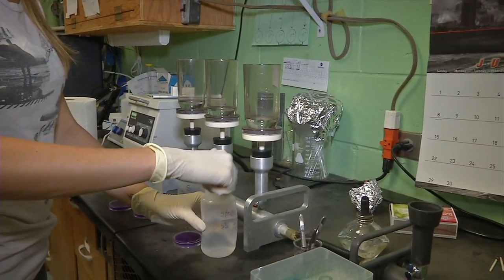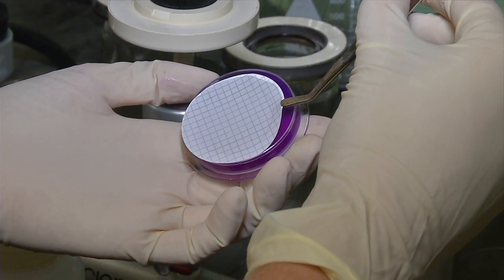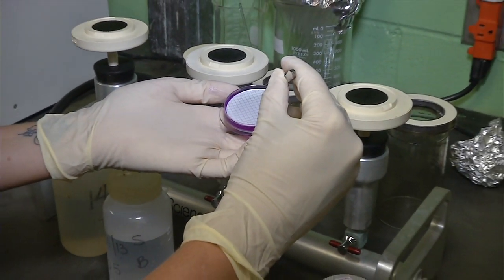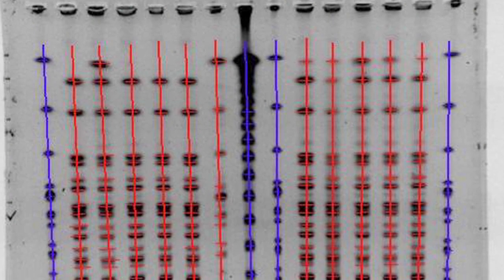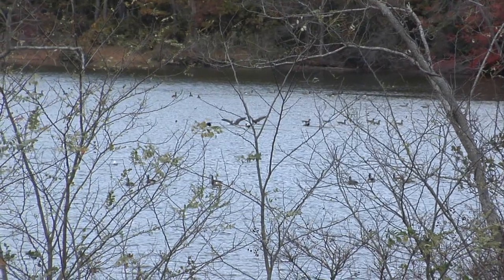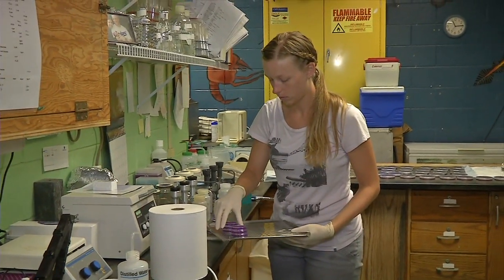One of the things we've developed over the years in response to, that's great, we know the amount of bacteria going in the water, is a tool that would help us answer who. And that is our DNA component, our bacterial source tracking. I don't think anyone else on Long Island is doing that, and it allows us to answer that question of who. So when we take a sample, we can say, yes, there's this much bacteria coming from it. We can run it through our DNA lab. It's kind of like a police blotter of fingerprints. We can use that identifying fingerprint for our animal database, run the water sample through, and it can tell us whether we're talking about a human here, a goose, or wildlife like a deer or something like that. The goal of this, hopefully with the DNA, is that we can then tell a municipality like Suffolk County that these are the inputs.